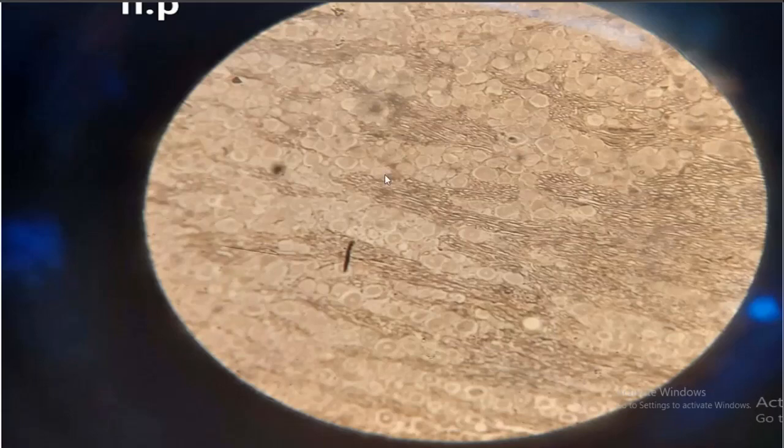So this is the sensory ganglion, and in this case, you need to look at the cell bodies. These are the cell bodies of the nerve cells.